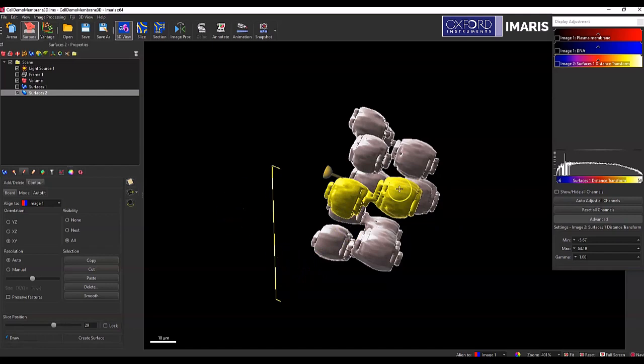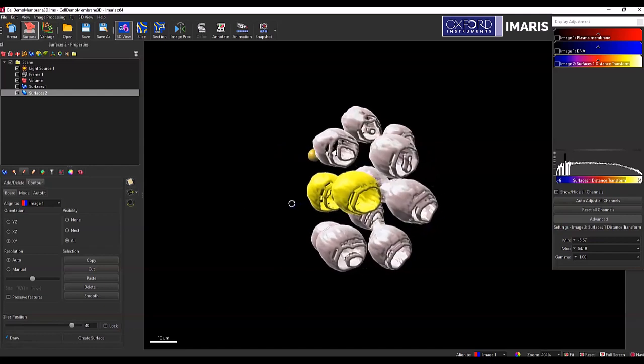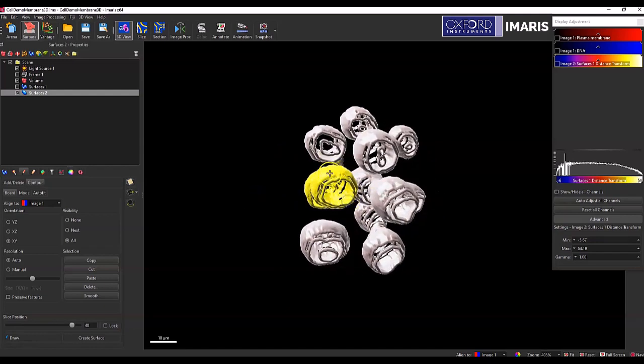And so, that's how I would use the distance transformation tool to create a dilation around my original surface of interest. Let me know if you have any questions.